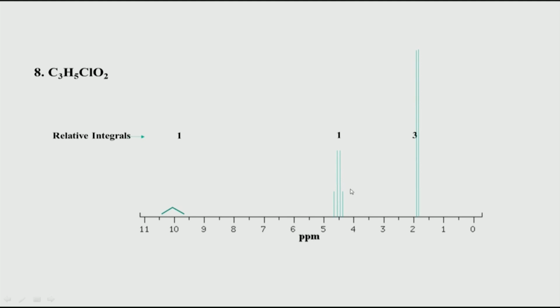So, if you now put all this together, before we see the final answer, let us try to work out what could be the structure. Basically this says I expect a CH3 here, that is why I get 3 integral, but this is a doublet. That means it is attached to a CH, only one hydrogen.